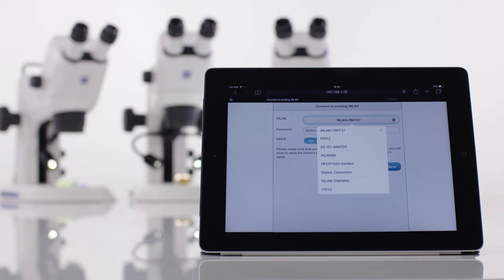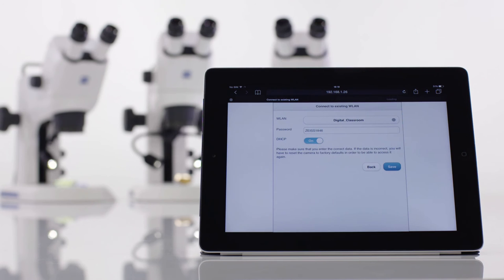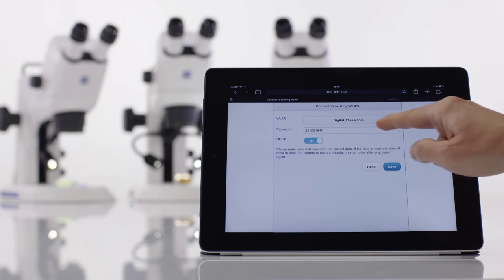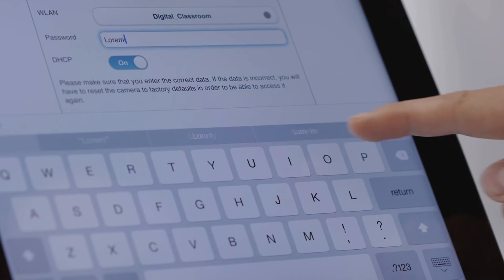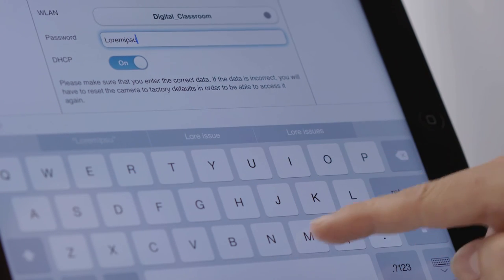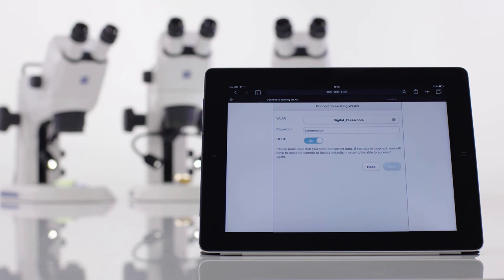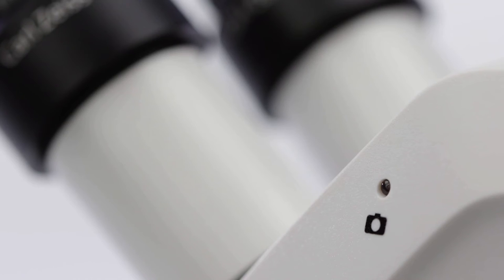Pick your Wi-Fi name from the list and enter the correct password. Finally, press the Save button. A few seconds later, the microscope will be connected to your Wi-Fi.